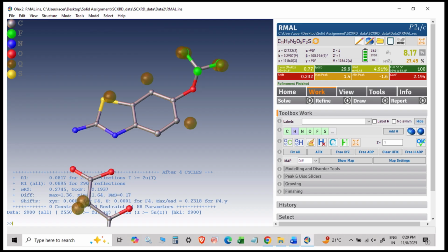Then we solved the riluzole moiety, but there still remained the question of whether it's malic acid or malonate. This is what we had to figure out. Initially, I was thinking that maybe it's linked to this particular moiety, but it is not. They are in a hydrogen bonded state. This is the final structure that I deduced.